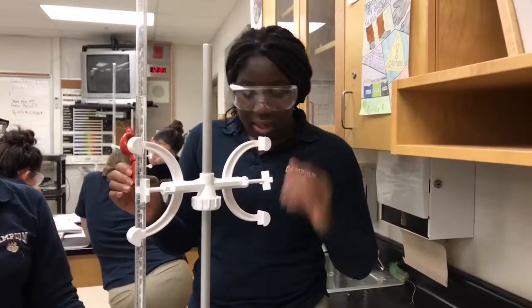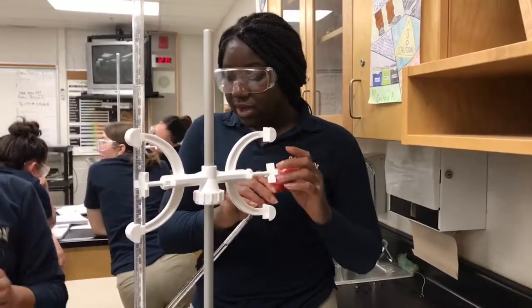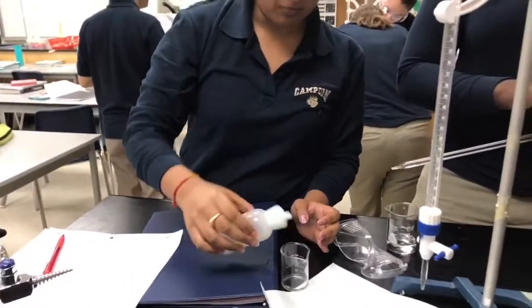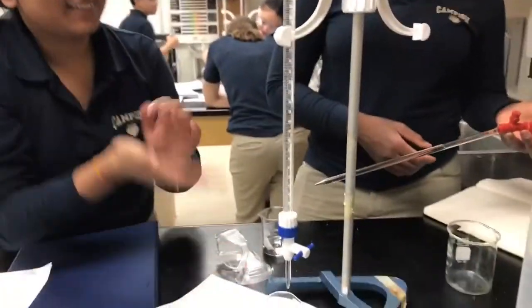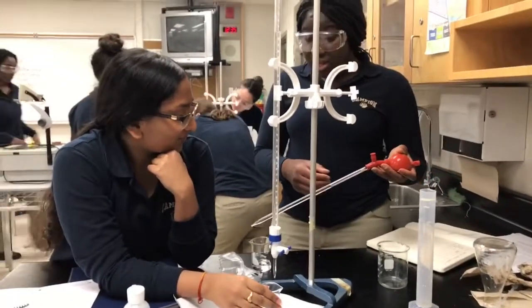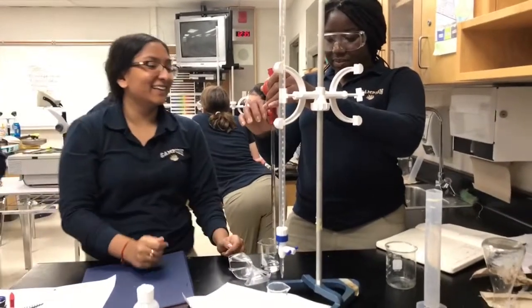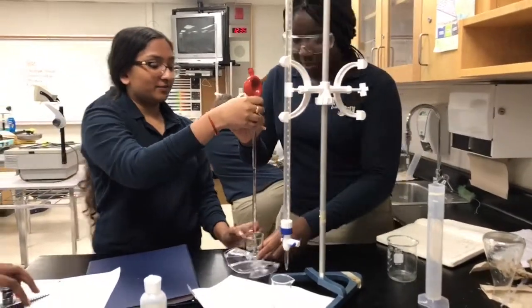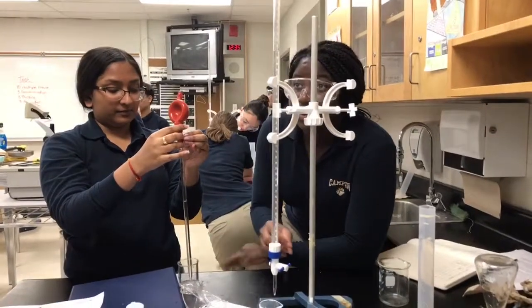1 milliliter. Okay. And then we're going to add some phenolphthalein, which is the indicator. Add the phenolphthalein, Manisha. It's a little bit much, it's okay. Get it under the burette. I'll turn it on. Okay, Tashi's taking the switching job. We're using 0.2.